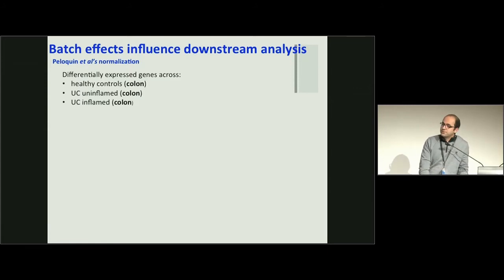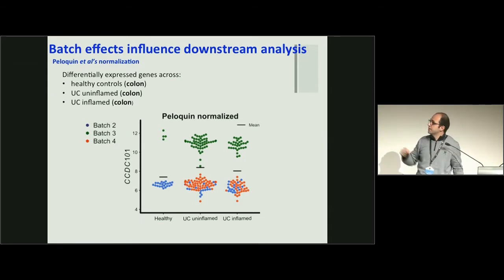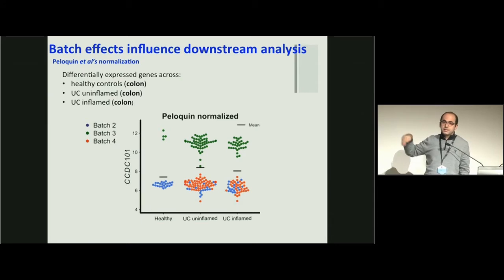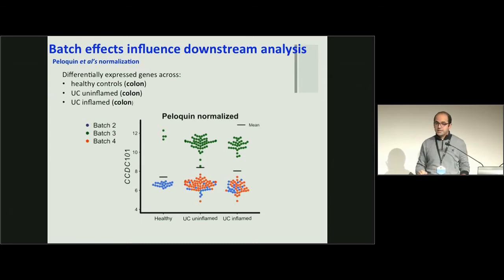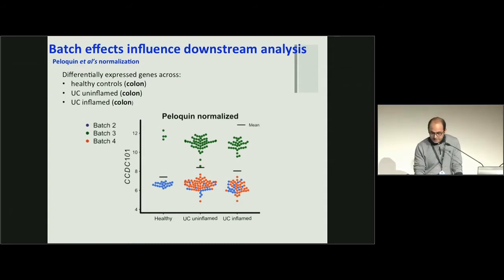How do these batch effects influence downstream analysis? Looking at three different groups in colon cancer tissue - with gene expression on the y-axis and groups on the x-axis - you can see that between healthy and inflamed groups, certain genes appear differentially expressed. But this shift in the mean is because of batch effects, not a real difference. This is how batch effects can influence downstream analysis - we saw many genes in this paper affected by batch effects that are not real signals.